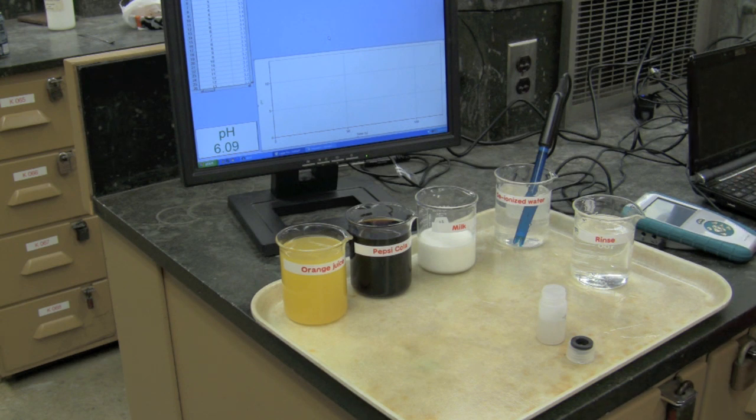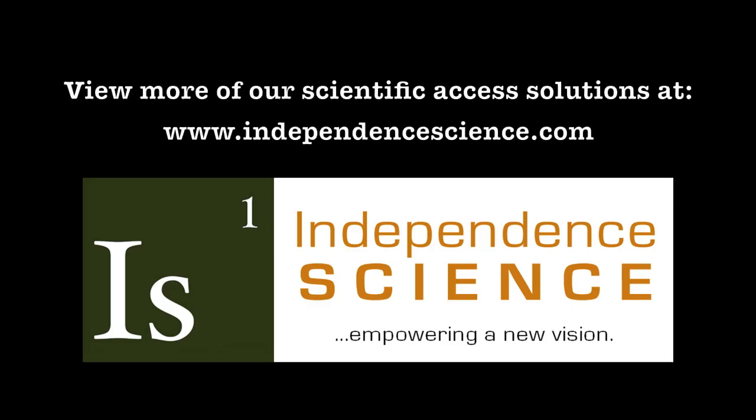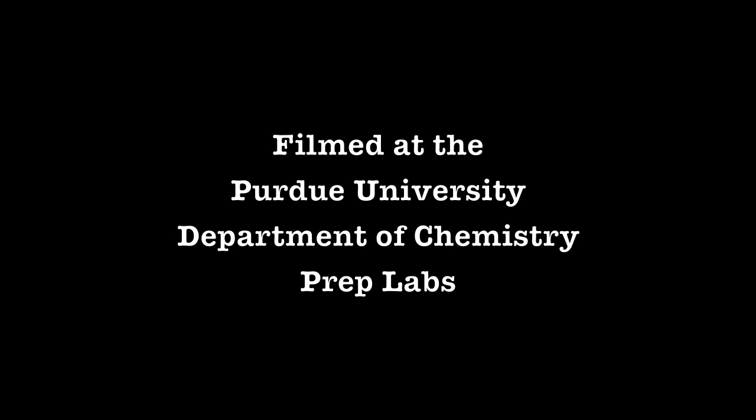The student has recorded the pH value of four different substances without visual aid. View more of our scientific access solutions at our website, www.independencescience.com. Thank you very much.